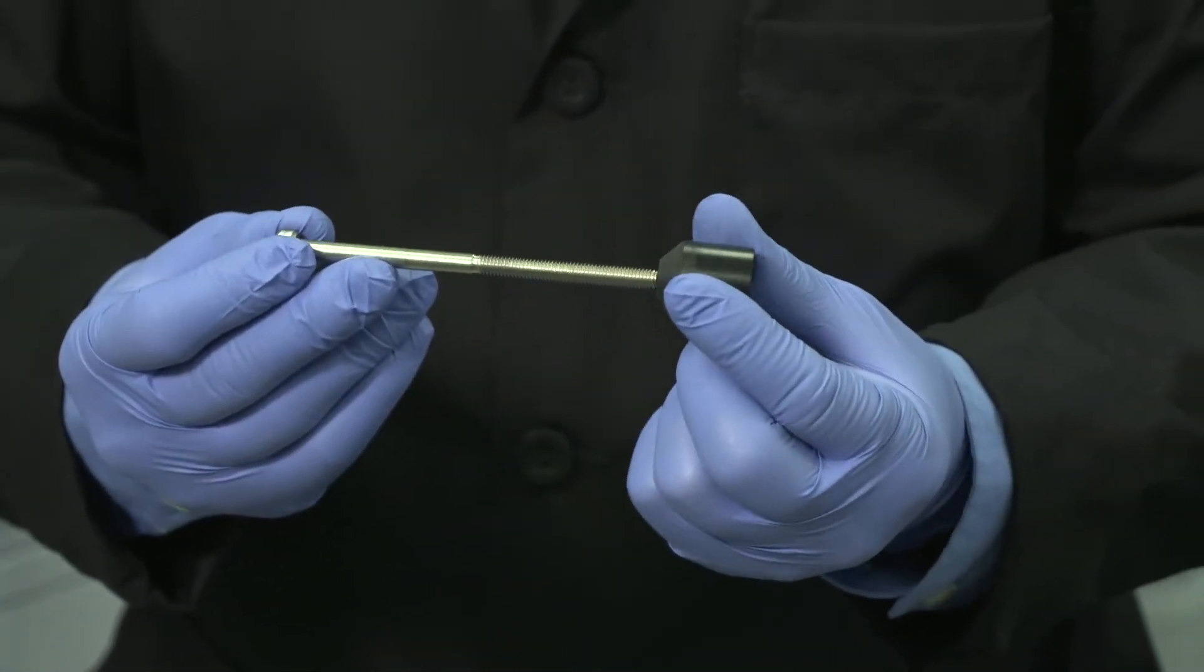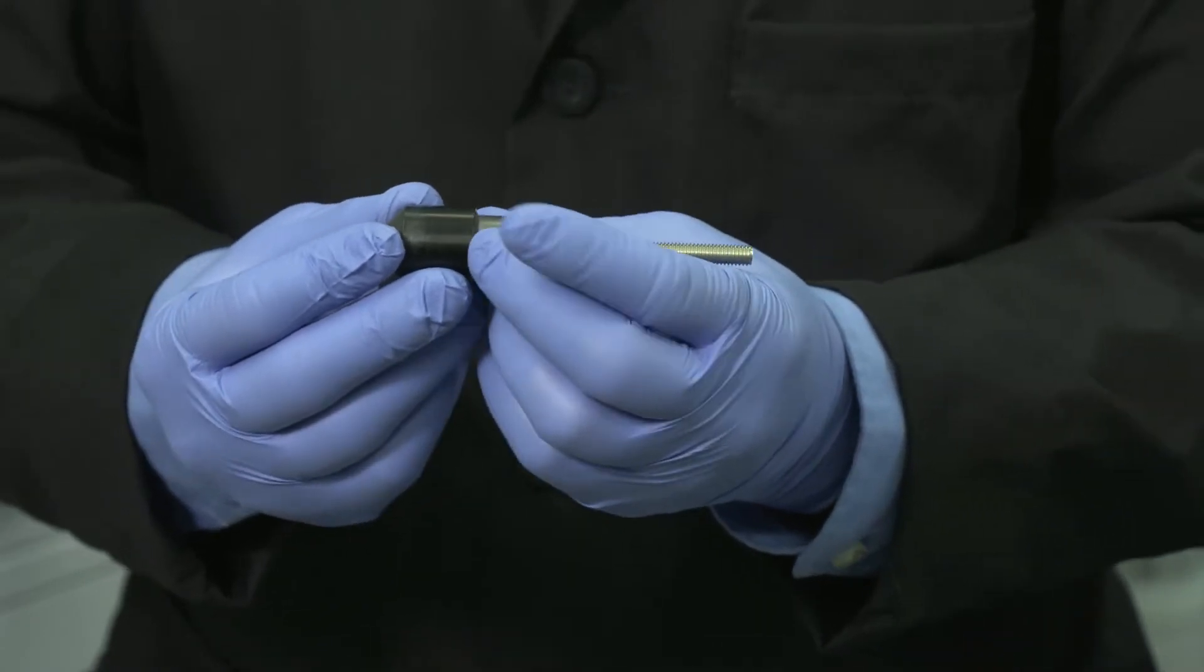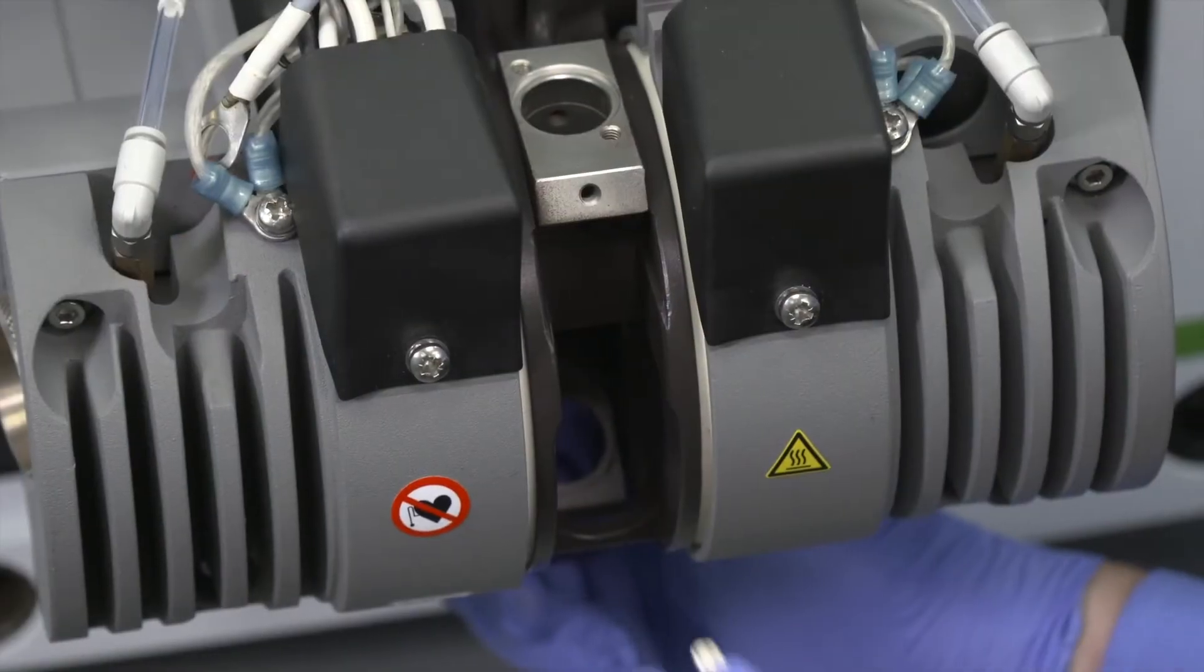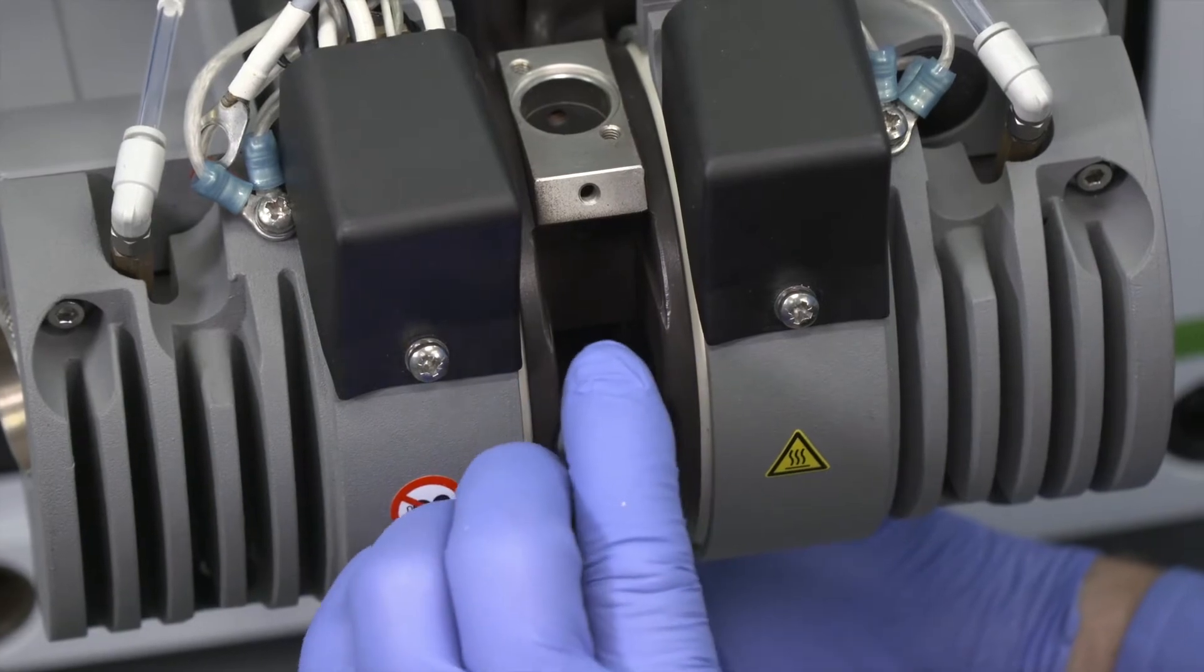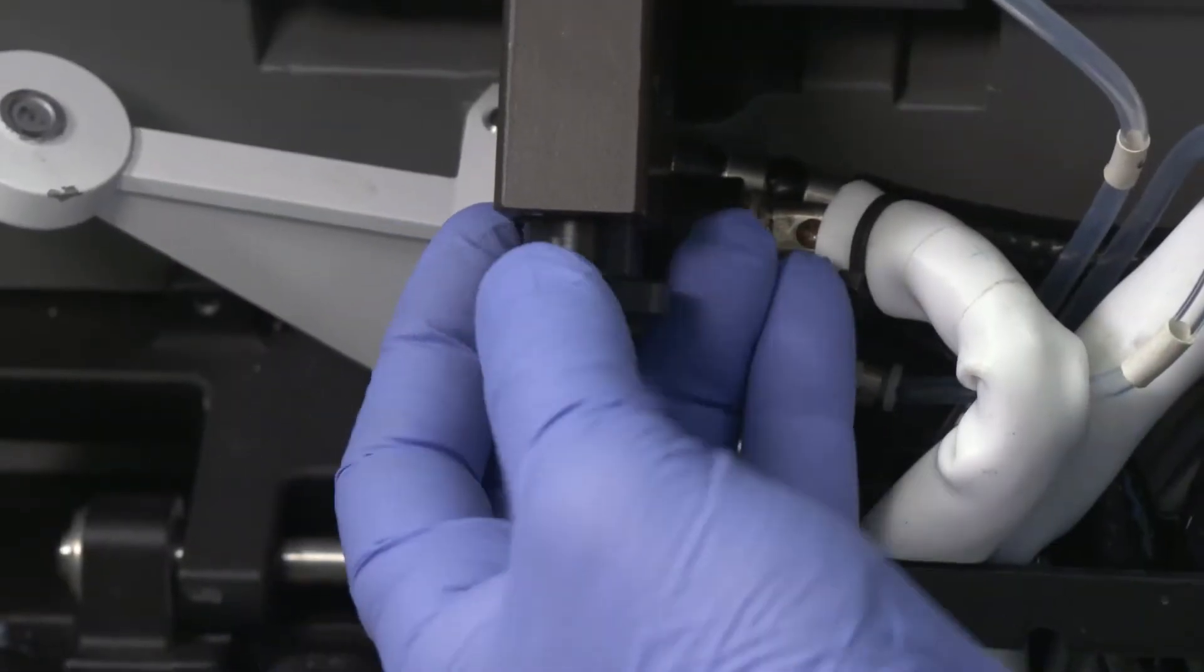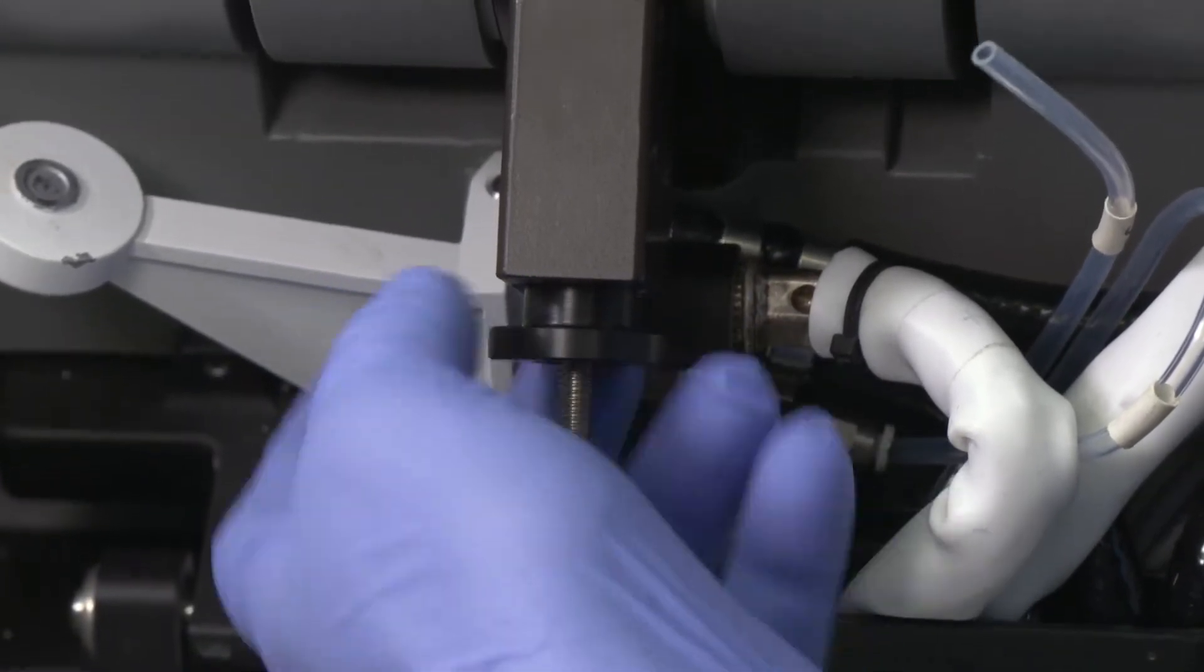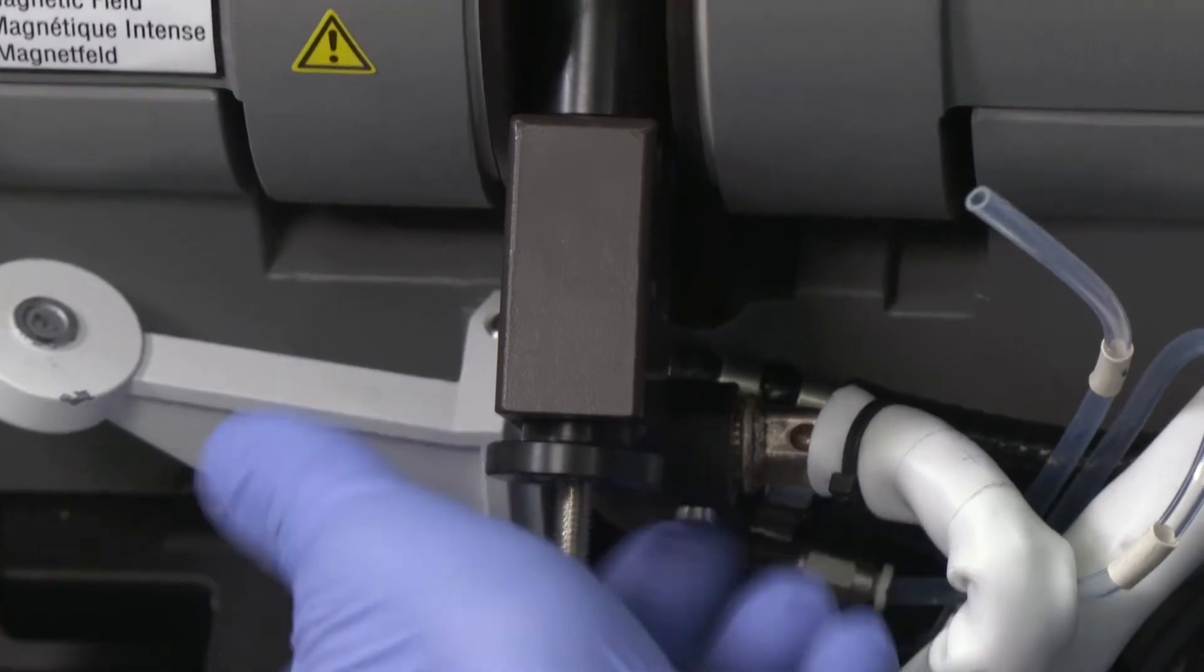To start, slide the guide and the front contact onto the long bolt. Then slide the bolt into the front contact housing such that the new contact sits in the opening of the housing. Then screw the threaded cylinder onto the bolt until the contact and cylinder are against either side of the housing.